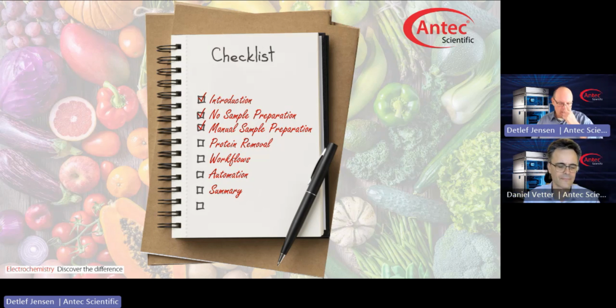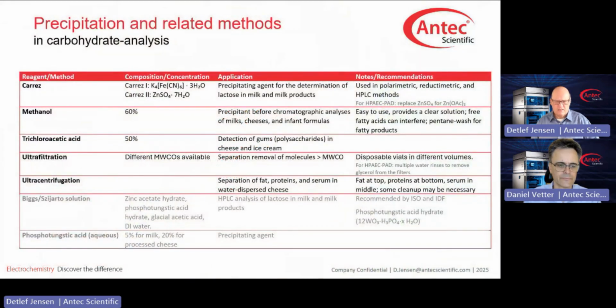So in order to avoid you being confronted with that protein washing out of the stationary phase, let's remove it up front. And during the presentation's preparation phase, I thought maybe it might be an idea to list the typical approaches for protein removal that you find in food and beverage analysis, and I came up with a little table which I should show you on the next slide.